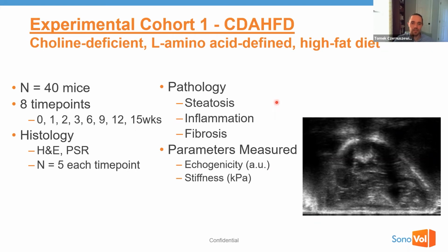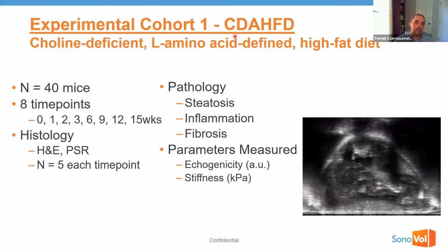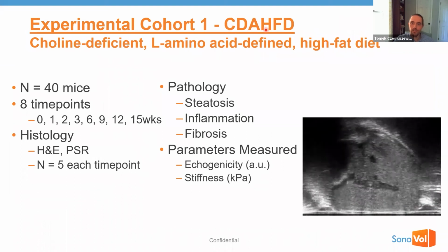Now I'm going to transition and let's talk about some data here. I'll spend a lot of time talking about this very first validation or experimental cohort that we did in a choline deficient high-fat diet model.